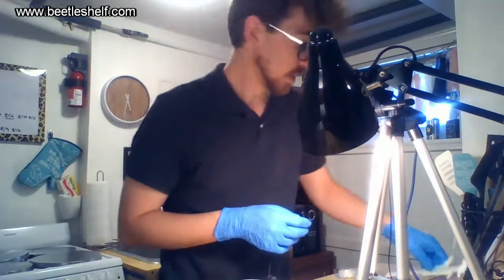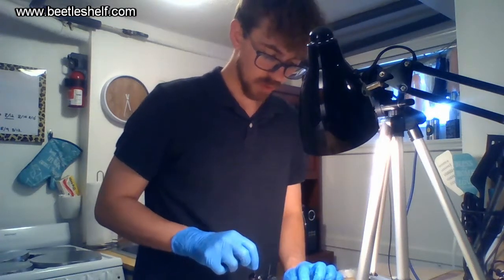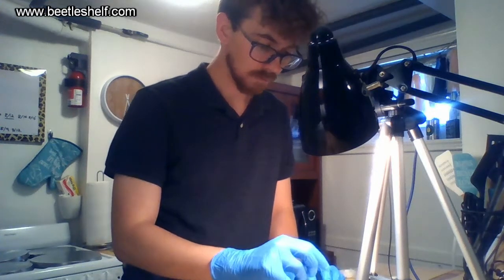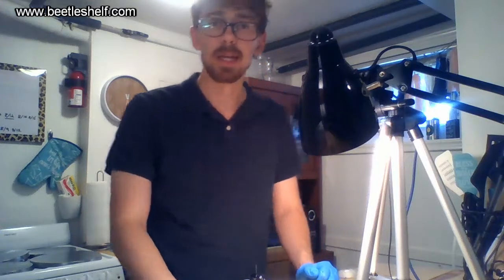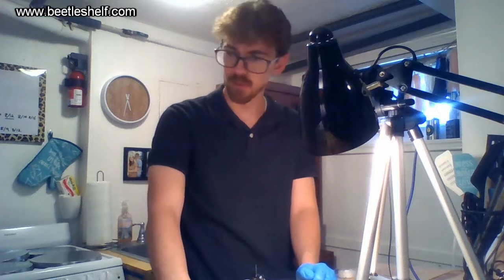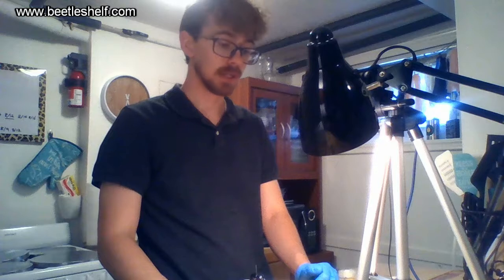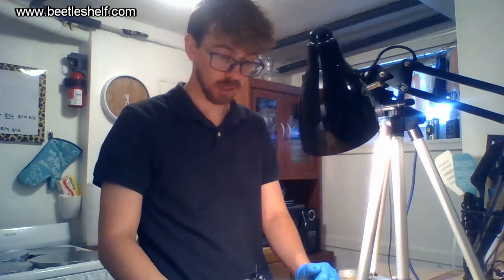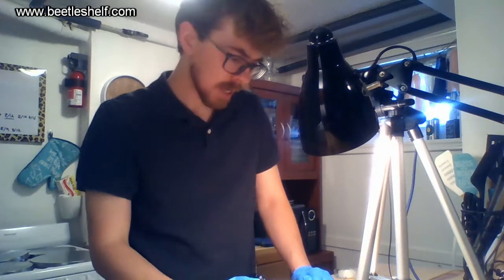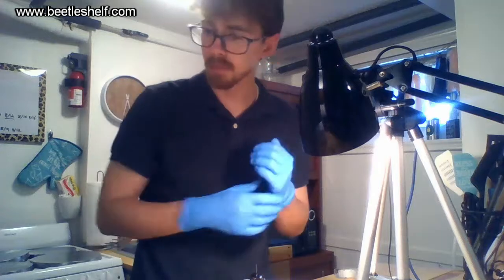I don't pin too often, but we'll walk through some do's and don'ts of pinning. I usually only pin insects that I've kept and raised myself, and I keep them as a memento of sorts. But today we have this really special gift from my good friend — he picked these up down in southern Utah.